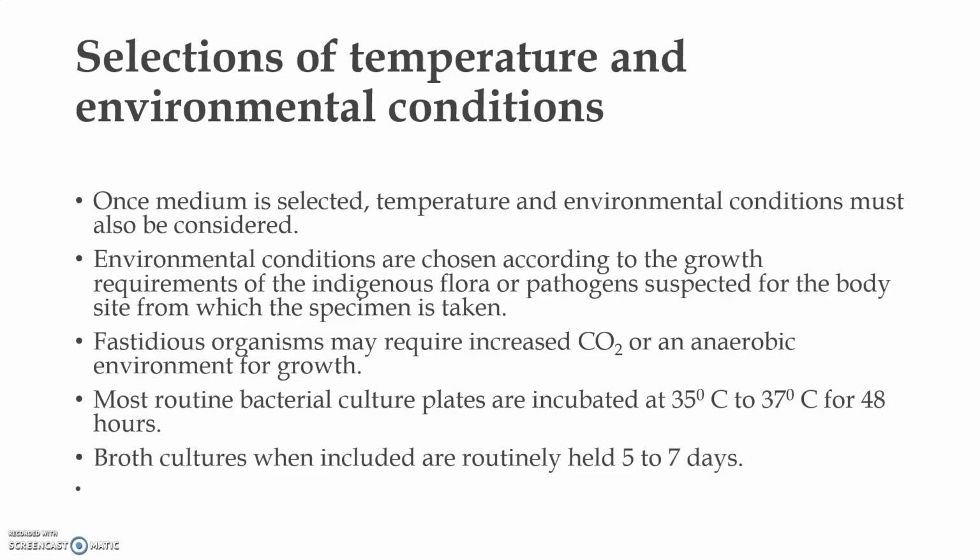Most routine bacterial cultures are incubated at 35 to 37 degrees Celsius for 48 hours. Broth cultures, when included, are routinely held 5 to 7 days. So the broth culture we are keeping for 5 to 7 days.